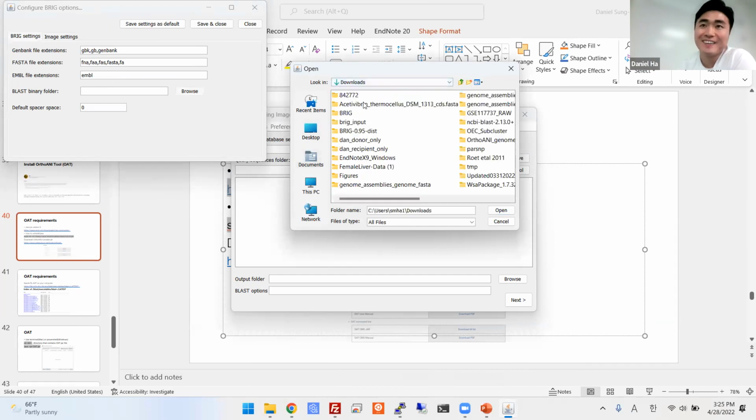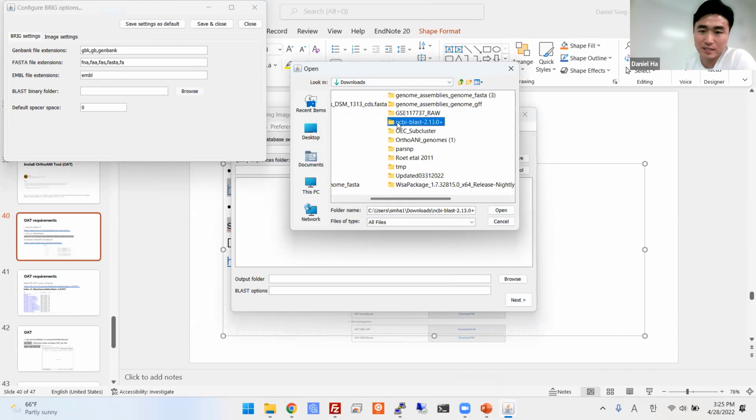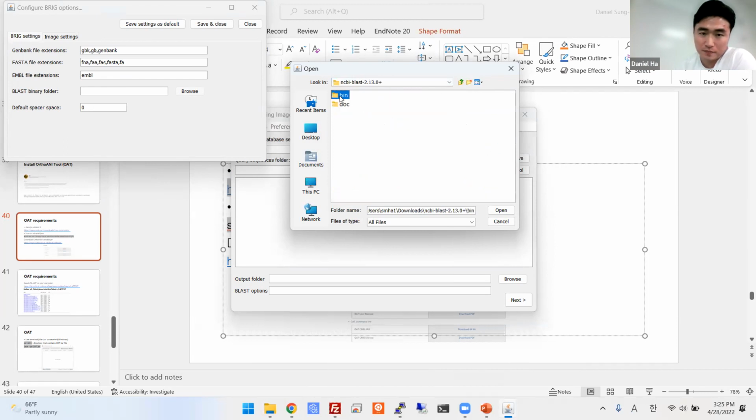I downloaded it on my desktop, so I don't have it on my laptop. I need to download it as well. So you guys go ahead and download the BLAST. Jenny, you can just use the path we used yesterday for A9. Sorry, what do I need to download also? BLAST.